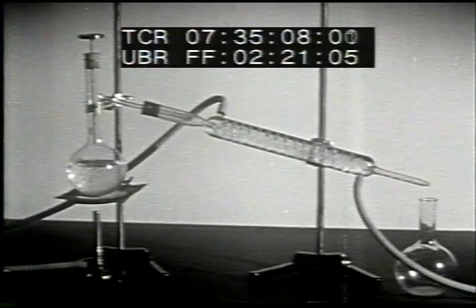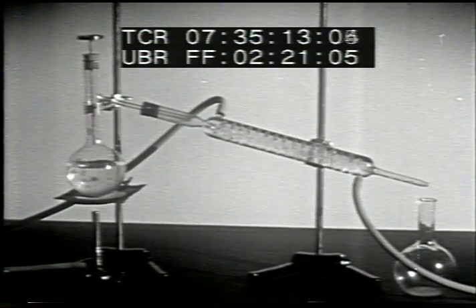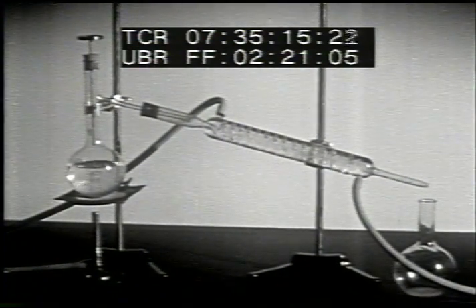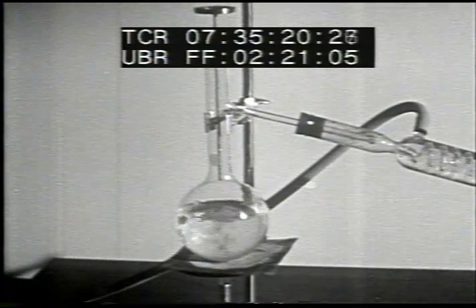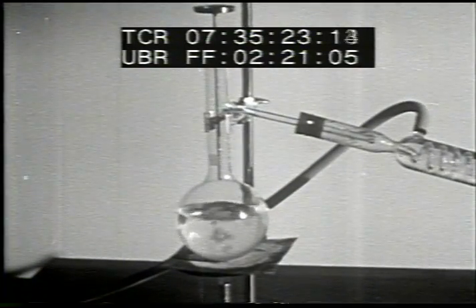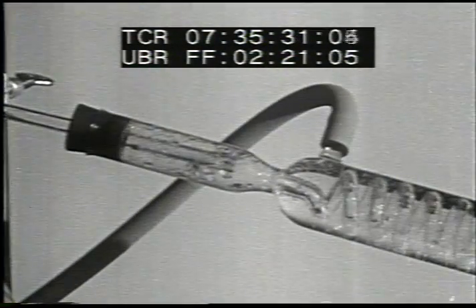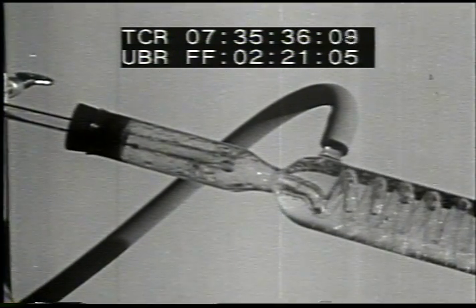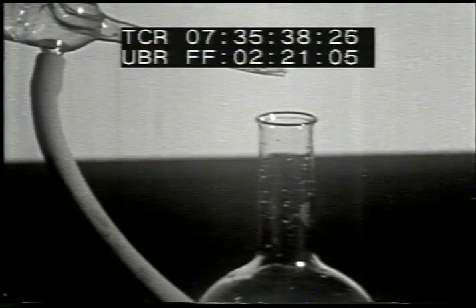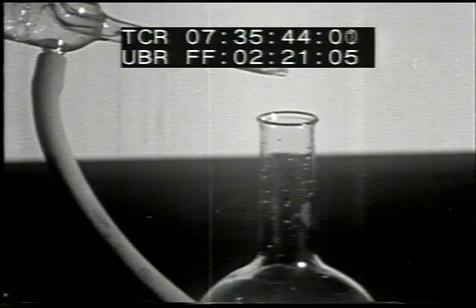The Liebig condenser is a glass tube surrounded by a water jacket. The circulation of cold water is necessary to maintain a low temperature within the condenser tube. The container at the left is a distilling flask. In the top of the flask, we have inserted a thermometer to measure the boiling point of the liquid. The invisible water vapor or steam moves into the Liebig condenser, where it condenses into drops as it is cooled by the circulating water. The liquid from the inner tube is called the distillate and is free from all non-volatile impurities.